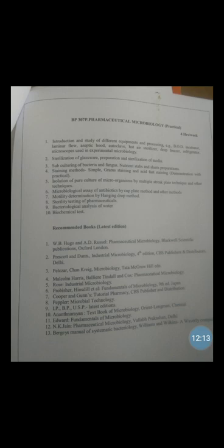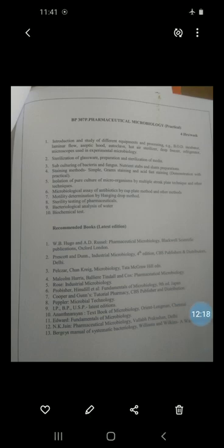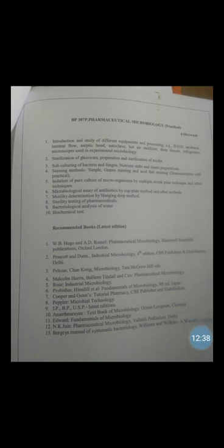Next question, which isolation technique is used to study the bacterial sensitivity to antibiotics? The spread plate technique is used to study the bacterial sensitivity to antibiotics. So this is all about this practical, that is to carry out the isolation of culture by using pour plate technique. I will stop here. We will see the next practical in the next session.